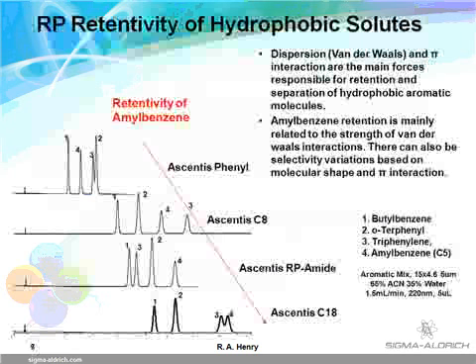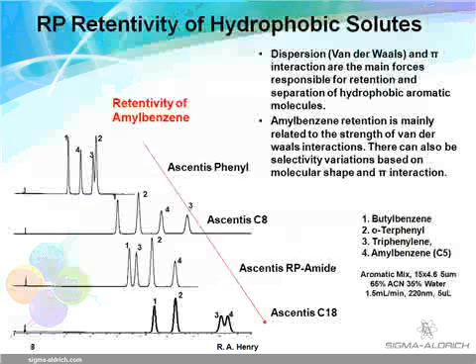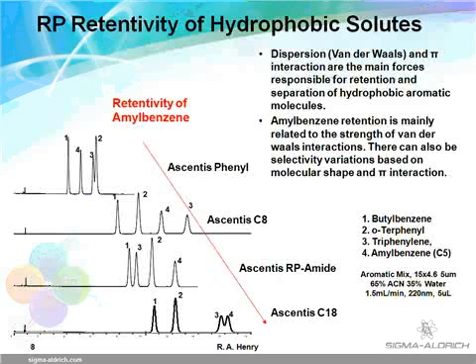The next slide confirms that solutes which are very hydrophobic and contain mostly carbon, such as simple aromatic molecules, typically show more retention and selectivity on C18 and C8 columns. Note that aromatic character of the solute does not make the aromatic phase more retentive, so the rule of like attracts like does not apply in this case. It is more often differences in chemical structure that create molecular attraction, retention, and separation.